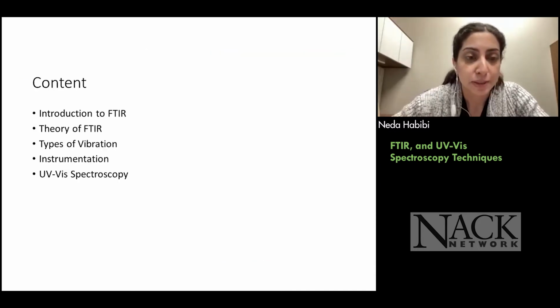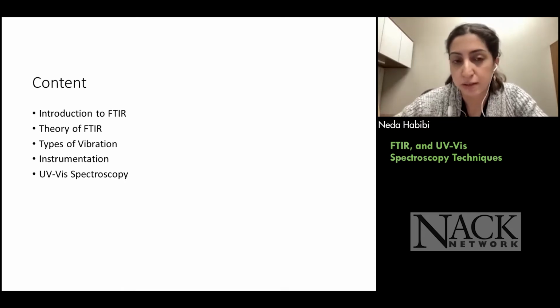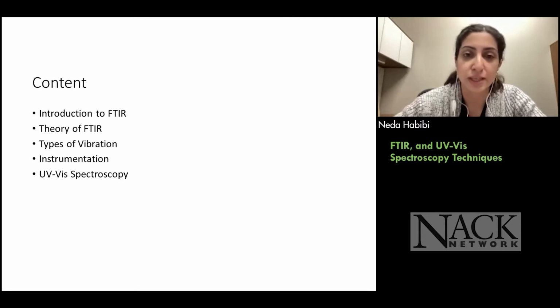So we're going to talk about an introduction to FTIR. I'm going to talk about theory of FTIR, working operation of FTIR. We're going to talk about types of vibration, the instrument, and then I'm going to talk about UV visible spectroscopy and why we use UV visible spectroscopy and what kind of information we can get from both of these spectroscopy techniques.